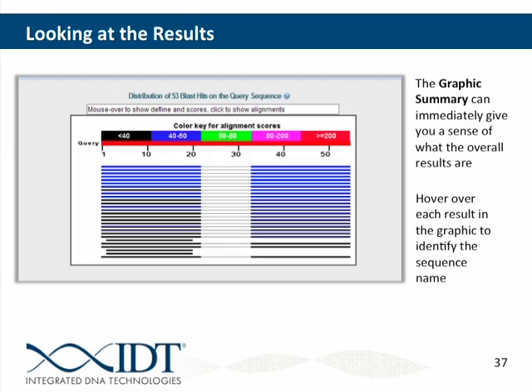And then we can get some more detailed information about each of these by scrolling down in BLAST and look at the results list. So here's the list of what each of those different lines represents. You can see by looking at the top, the transcripts that our primers are hitting. The primers seem to be specific to our target of interest, which is HMGA1. It's showing the various different transcript variants for HMGA1.